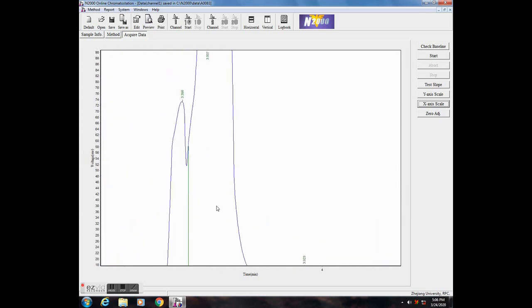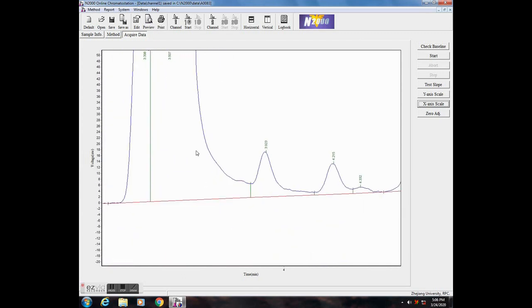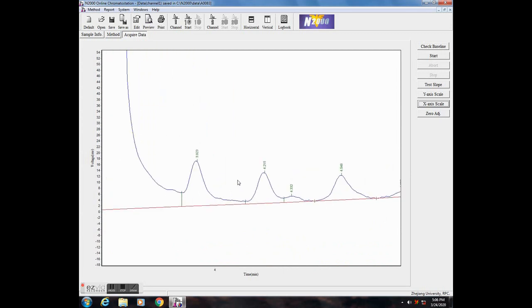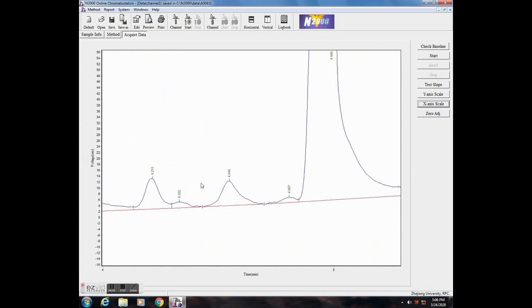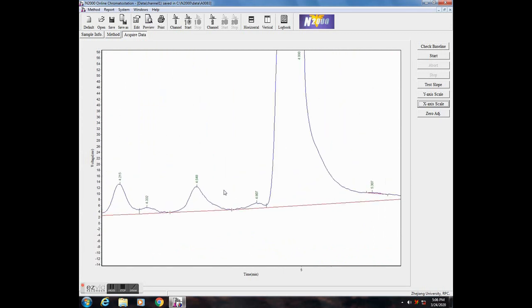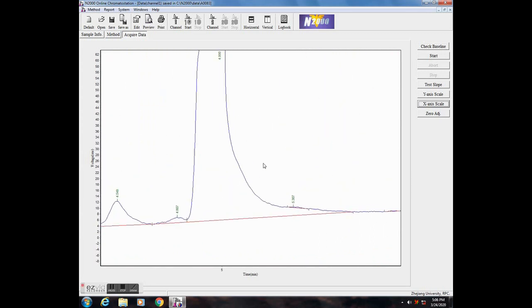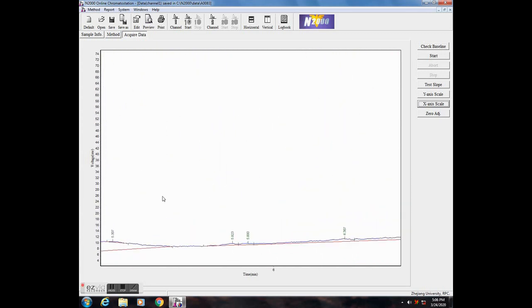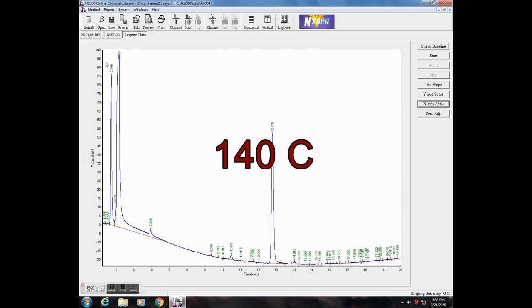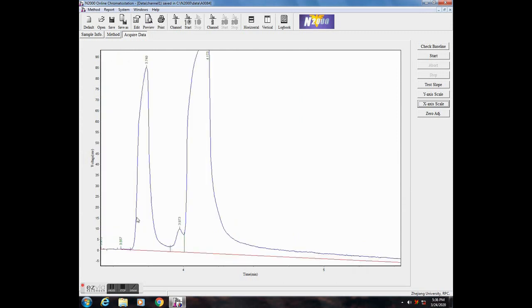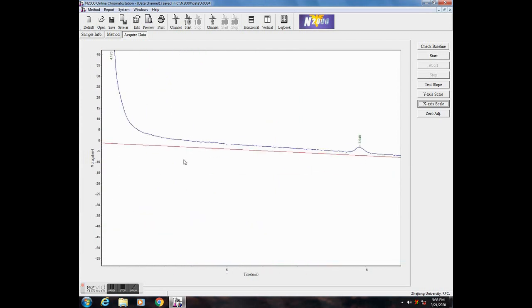There is something that elutes very fast and is probably very small — even faster than DCM — and then other molecules before the larger one. Decreasing the temperature will give us a better resolution of this area. At 140 degrees, we can see there are actually two molecules, one of which I suspect to be water, but I'm not sure.